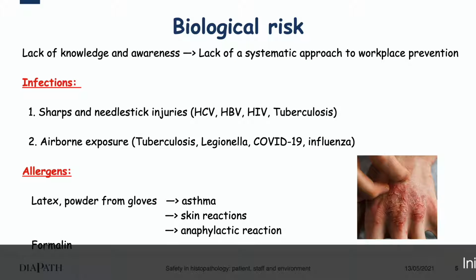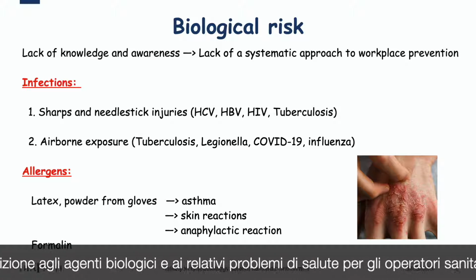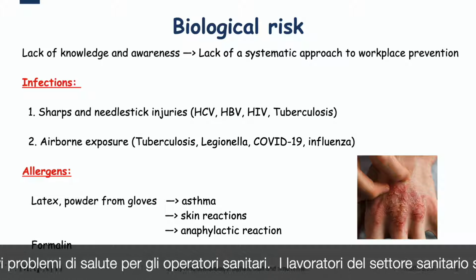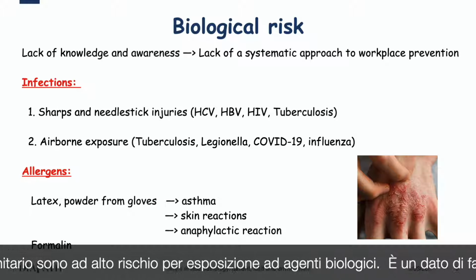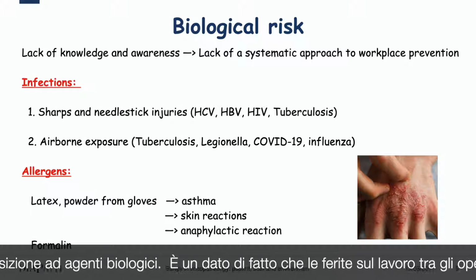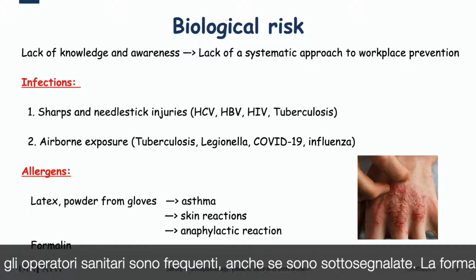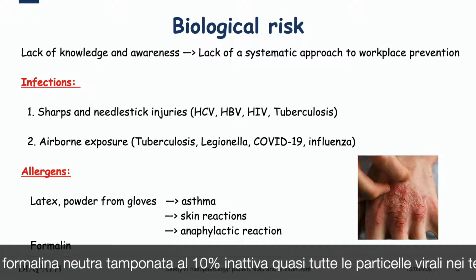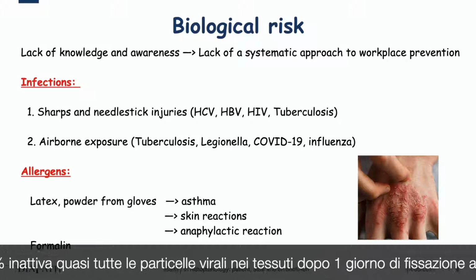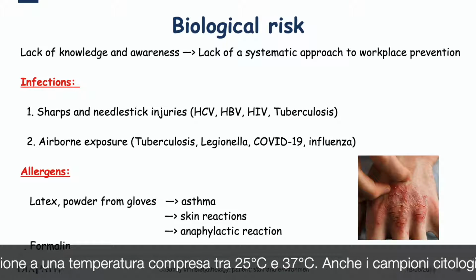Let's start with the risk of exposure to biological agents and related health problems for healthcare workers. Workers in the healthcare sector are at a high risk of exposure to biological agents. It is a matter of fact that occupational injuries among healthcare workers are common, although they are underreported. 10% neutral buffered formalin inactivates almost all viral particles in tissue after 1 day of fixation at a temperature of 25 to 37 degrees centigrade.